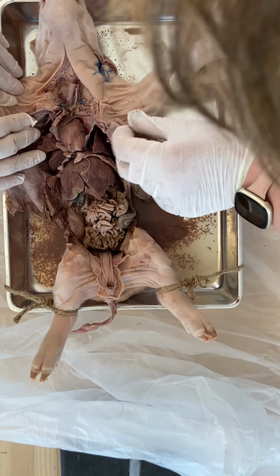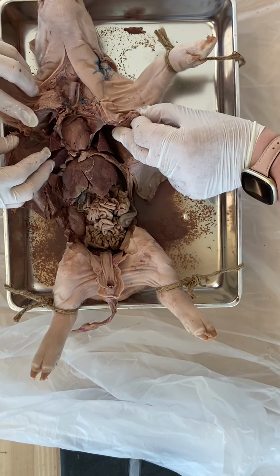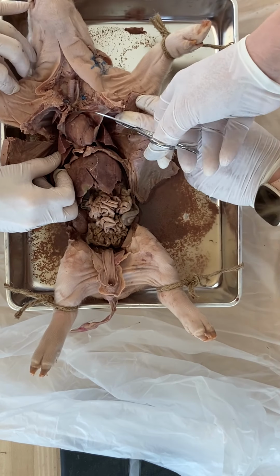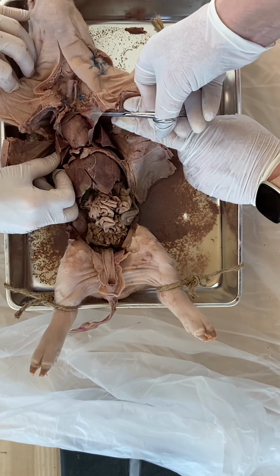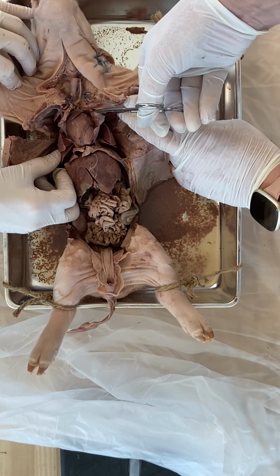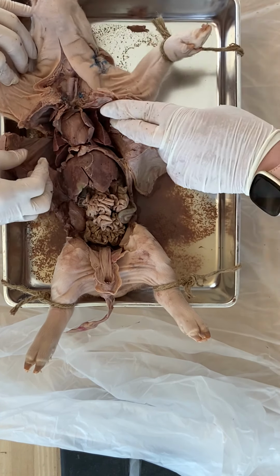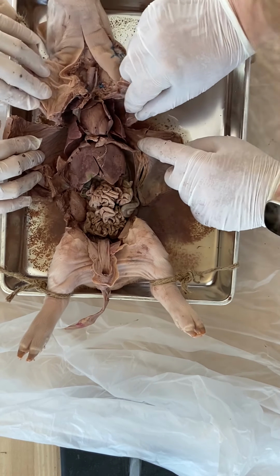All right, now what's next, Mrs. Bastow? Let's look for some lungs next. So we'll cut this membrane. That's the pleural membrane there, yes? So the pleural membrane is the membrane that is wrapped all the way around the outside of the lungs. There's another blood vessel there, and I don't want to snip too many. This side's open. That side's open, so these look nice.